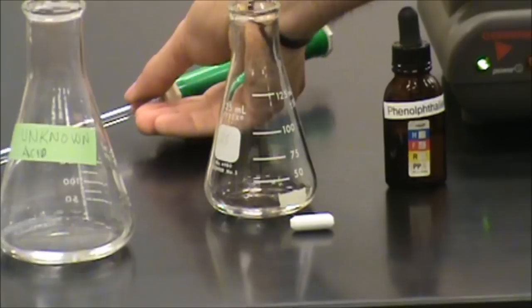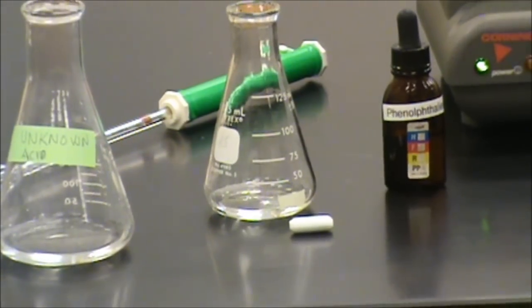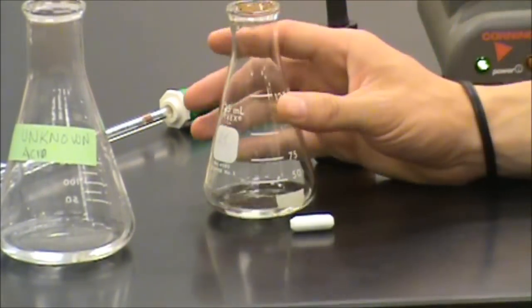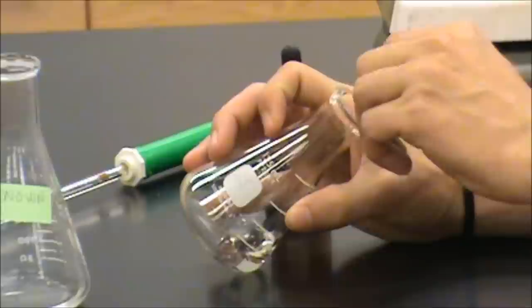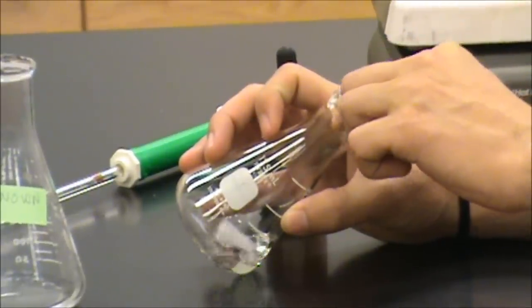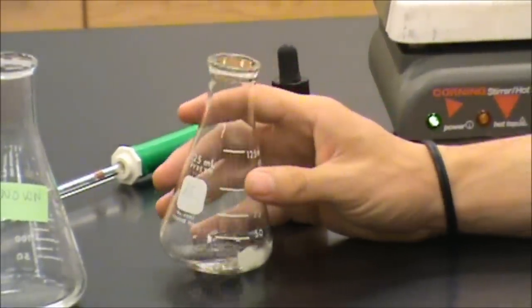If you haven't already added your magnetic stir bar, you want to gently tilt the container and slide the stir bar down the side in order to minimize splashing.